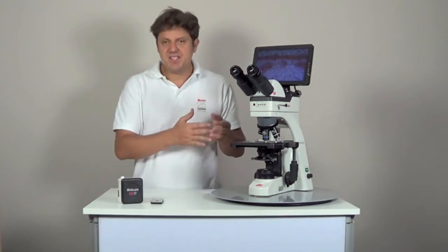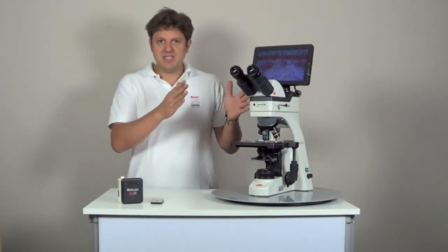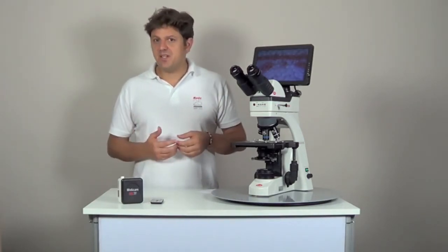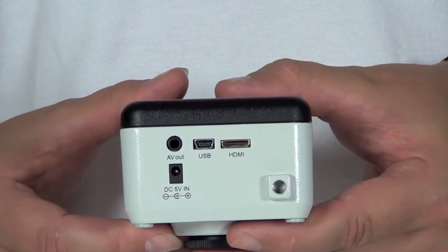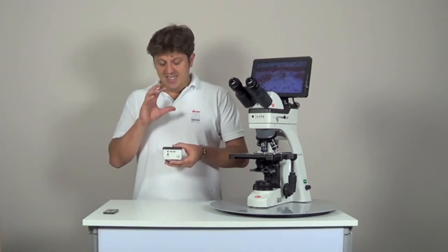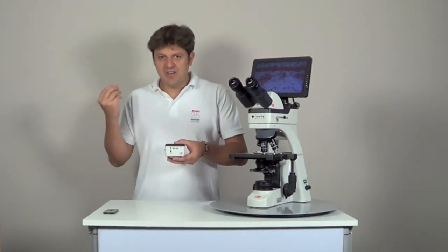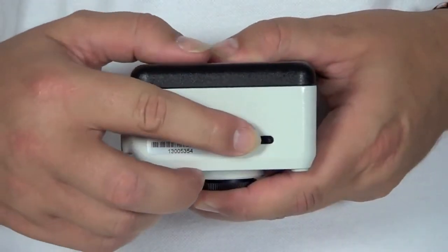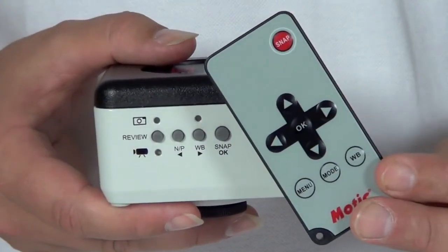The Moticam 580 and 580INT are high definition cameras with several output options. Both cameras have the same technical characteristics, but the difference is that the 580INT is meant to be integrated in a BA Elite microscope while the 580 can be mounted on any microscope through the C-mount. The main feature of the Moticam 580 is the HDMI output which transfers images to a flat screen or a projector. It delivers a fast live image of 30 frames per second at a resolution of 1080 lines. The image processing is done inside the camera so no computer is needed, making it ideal for educational laboratories. You can capture images of 5 megapixels, record videos and store them on the SD card. The camera is controlled with the operation buttons on the side or with the remote control.